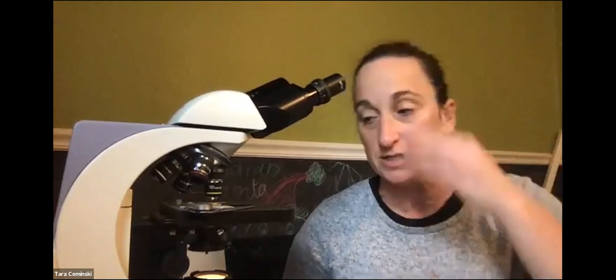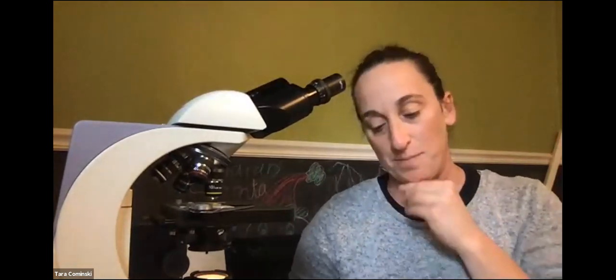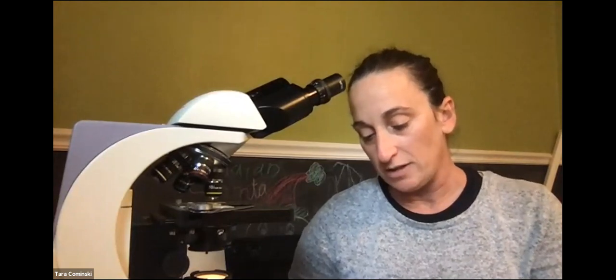What we want to note is the basic differences in how those cells look under the microscope. It's going to be a little hard for you guys to tell because I'm just sharing with you, but hopefully we can get the basic idea. You can label the diagram that's there. On page 24 where it says onion epidermal cells, just label that diagram based on that picture.